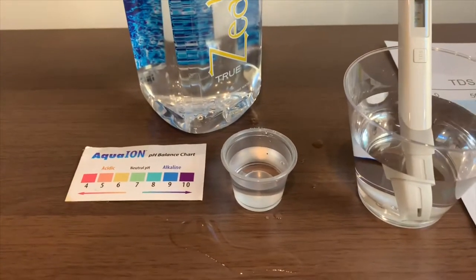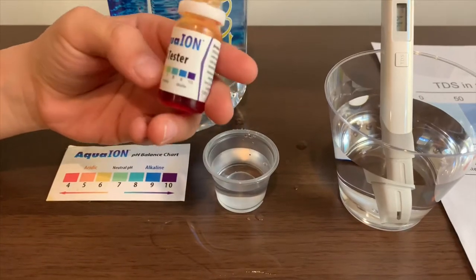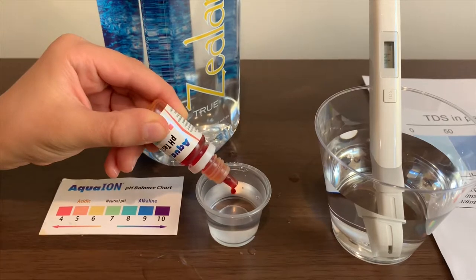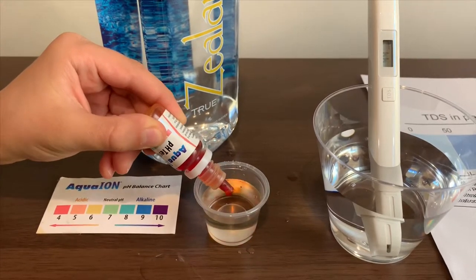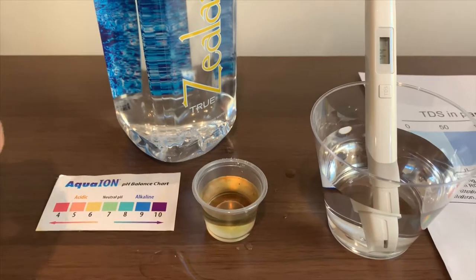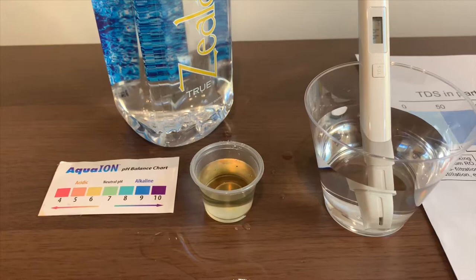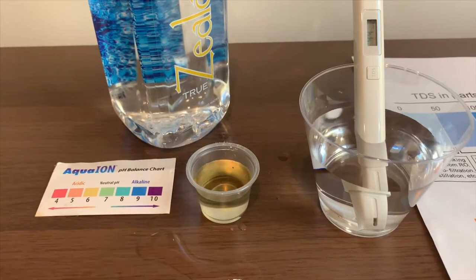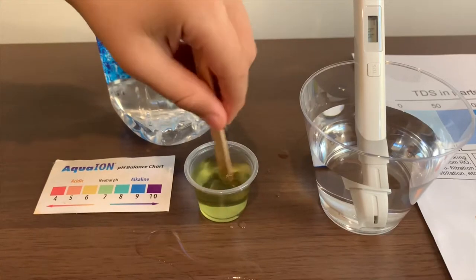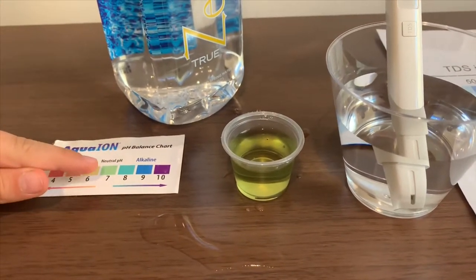Now, let's test the pH level. Only do two drops. And if you want to buy this pH tester, check the link down below. Let's mix it a little so we'll get a better result. I give this a 7 and a neutral pH.